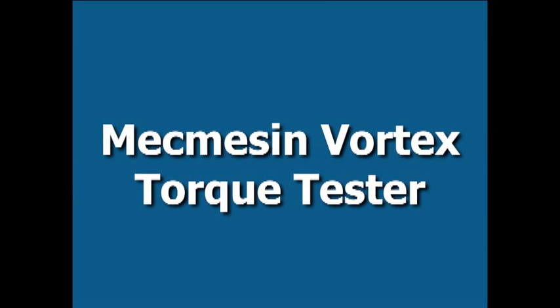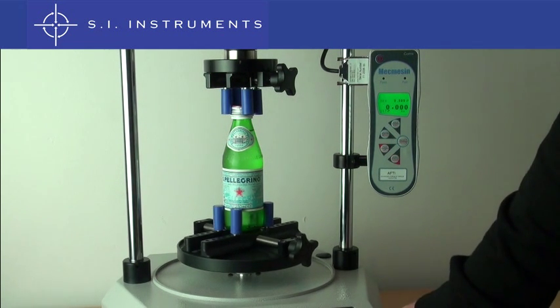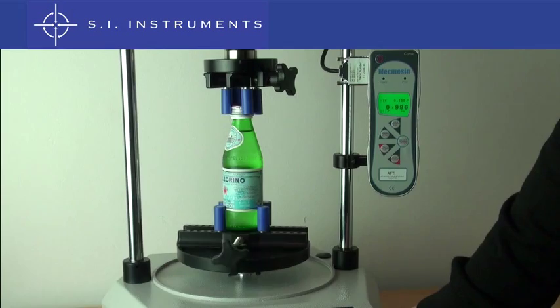The McMesson Vortex Motorized Closure Torque Tester combines accurate torque measurement with motorized action to completely eliminate operator influence during testing.